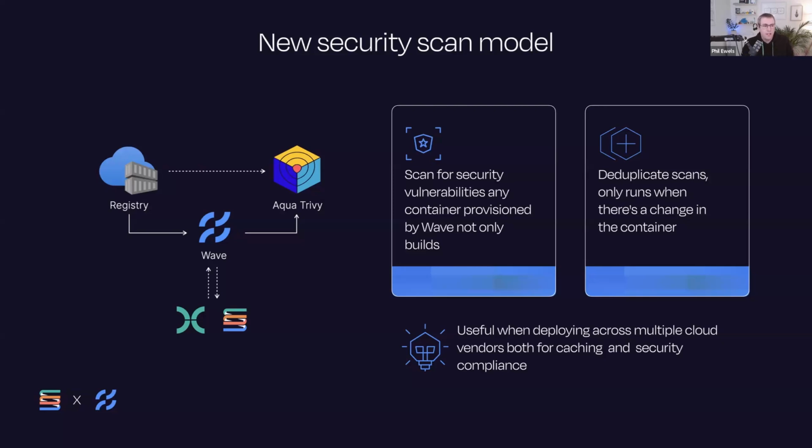This also comes with new functionality within Nextflow and also the Wave CLI, where you can configure Nextflow to fail if any security vulnerabilities are found which pass a certain threshold. So you might say, I don't want to run if there's any high consequence vulnerabilities, and Nextflow will crash with an error. Therefore, if you keep running your old pipeline, which is well known and well standardized, and you haven't touched anything in it, and new high security risk vulnerabilities come out, then your pipeline will stop running and give you an error so you can go and sort that out. So especially for people working with sensitive data, this can be really, really good.